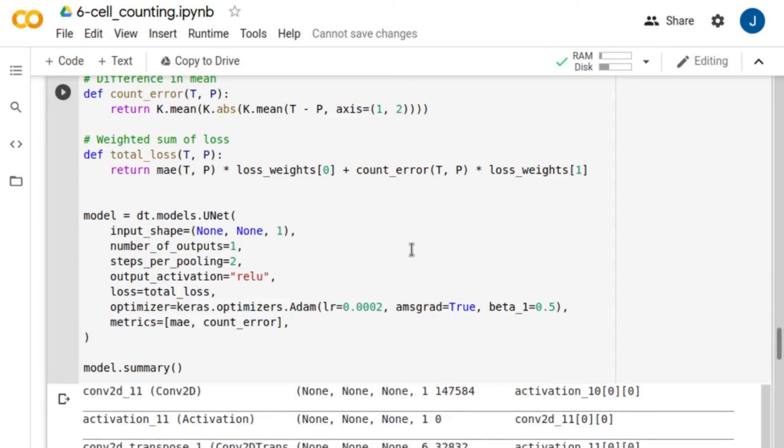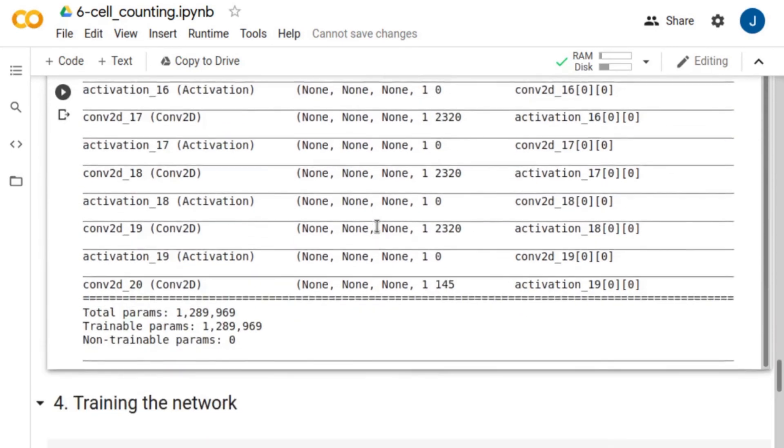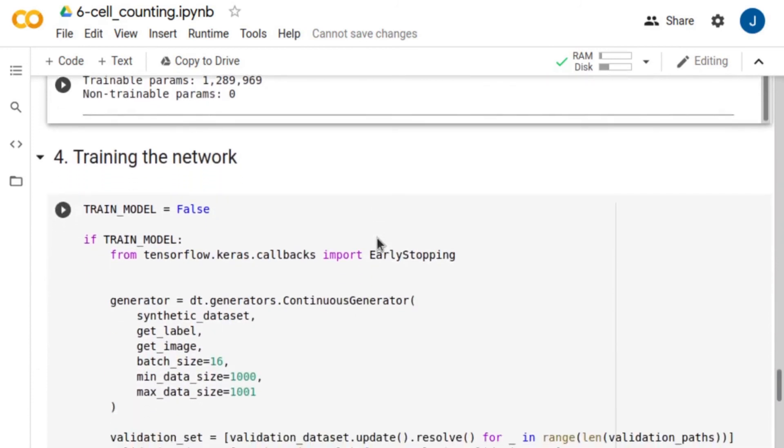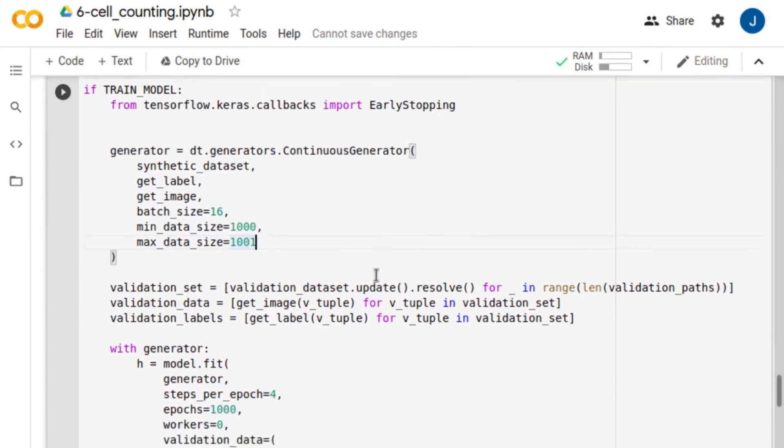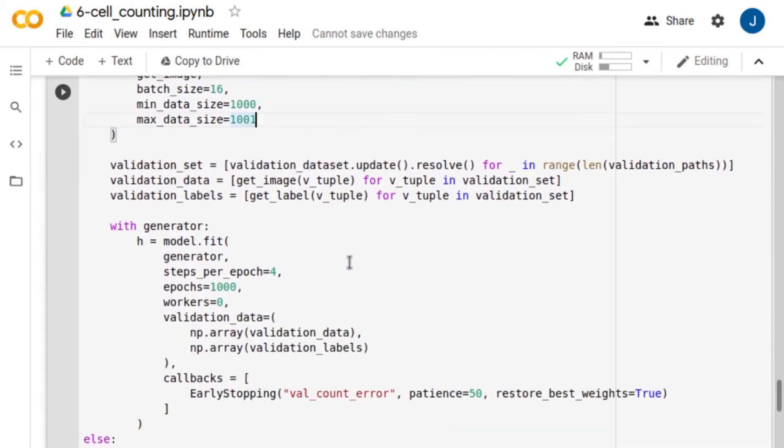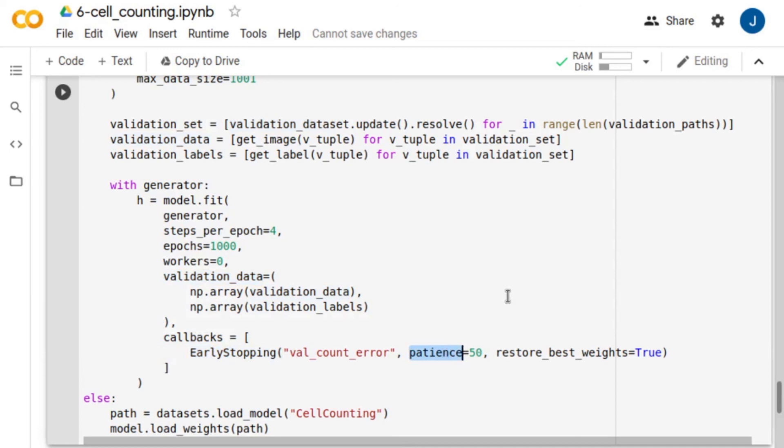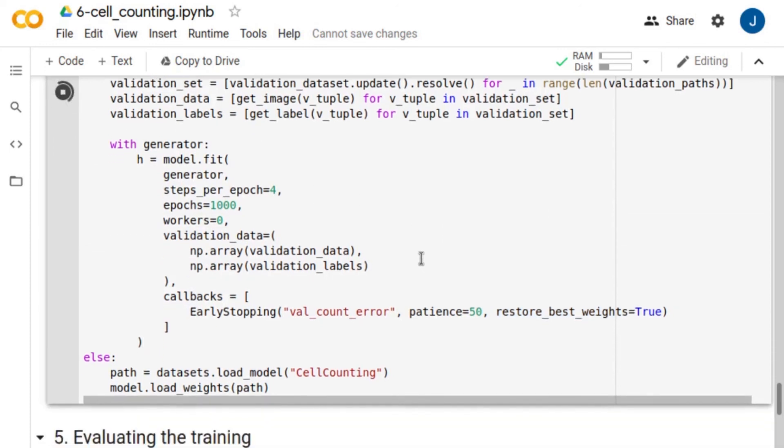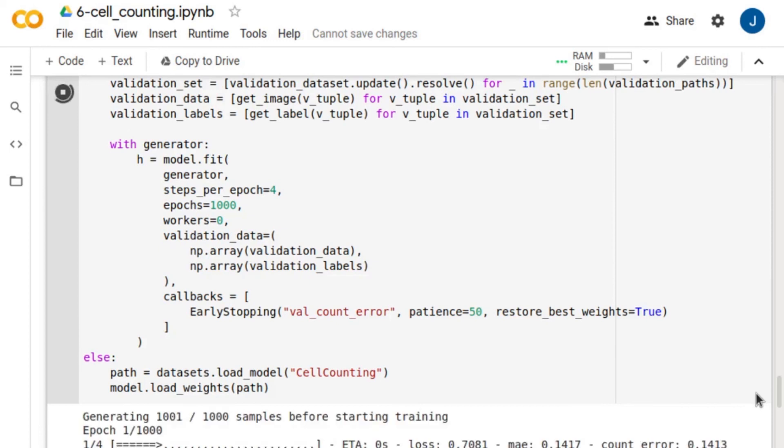Here we see the model summary. Now, it's time for training. We use a continuous generator to train the network. We also define the validation set and train the network for 1000 epochs. We monitor the performance of the network based on the validation set using an early stopping callback with patience of 50 epochs. Note, we set the restore best weights argument to true. This means that we restore the model weights from the epoch with the best validation value.